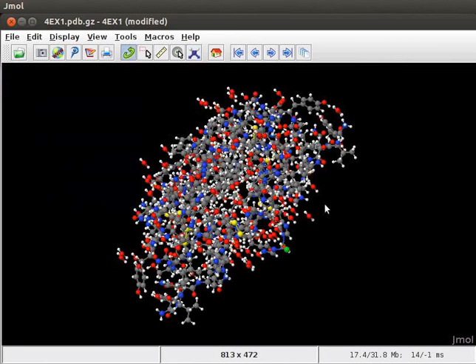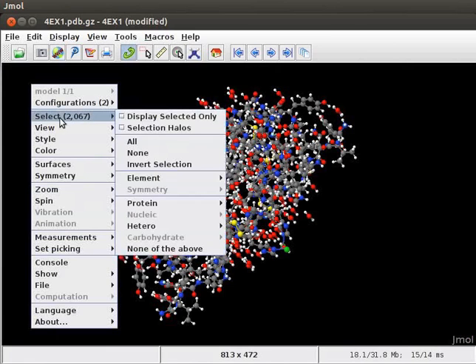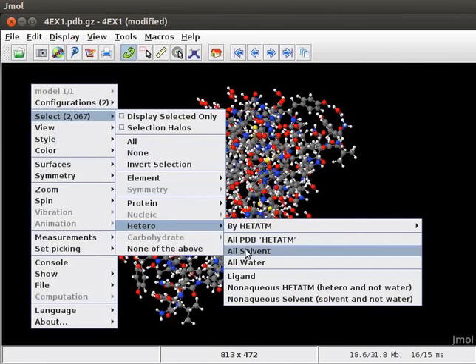The protein structure is also shown with water molecules. To hide the water molecules, follow the steps as shown. First, open the pop-up menu. Go to Select. From the sub-menu, choose Hetero. And click on All Water option.